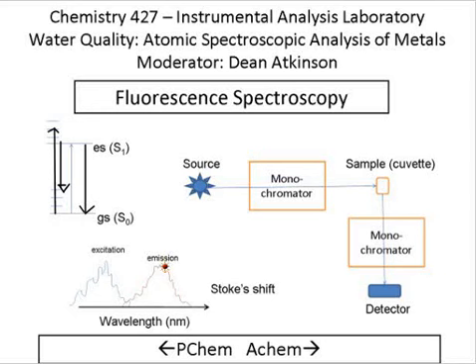In principle, you can measure both of those at the same time. That's a fairly complicated experiment that people don't always do. If you're interested in just measuring stuff, though, if you're an analytical chemist and you just want to measure this analyte that's doing the fluorescing, it's pretty simple. The best place to excite is where this peak is.